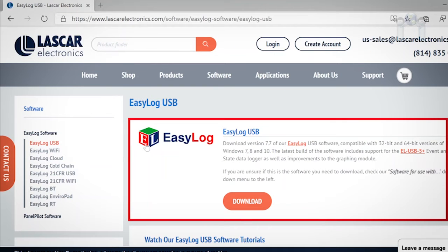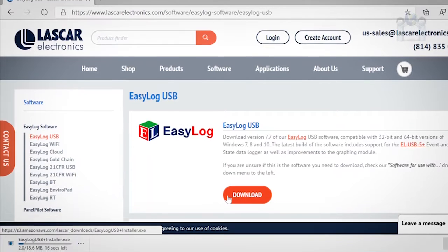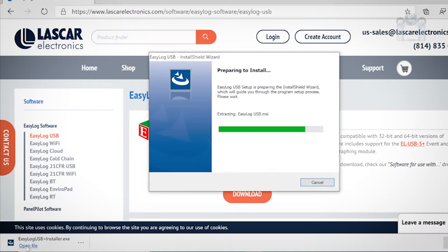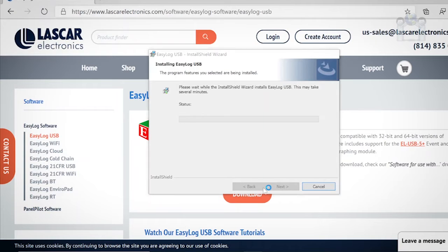At the top of the page you will see the EZ-Log USB software box and a download button. Click the download button and a small box should appear showing the name of the download file and the progress. When the download is complete, click on Open File. The installation is very basic — just acknowledge the agreement and follow the prompts. When finished, click the Finish button.